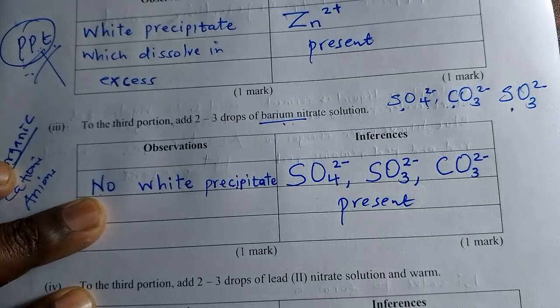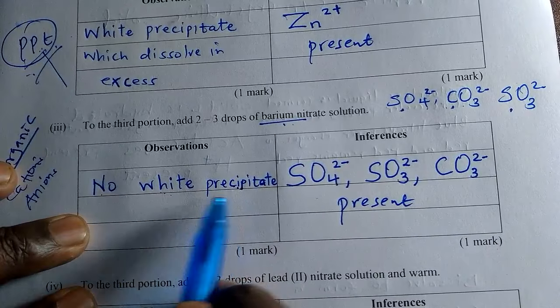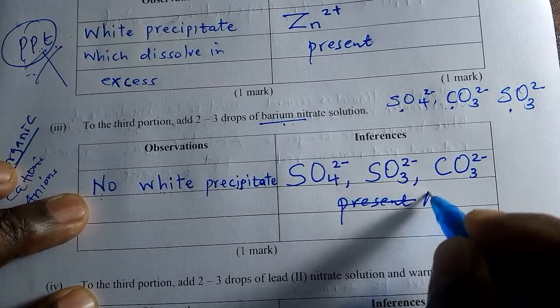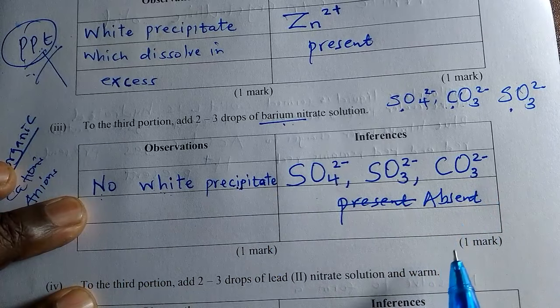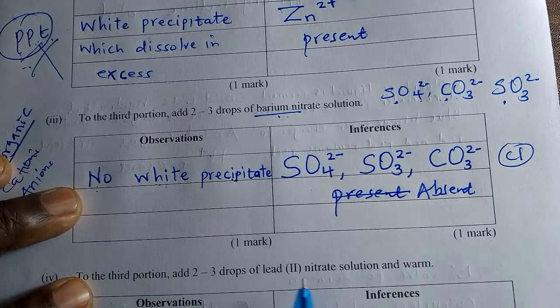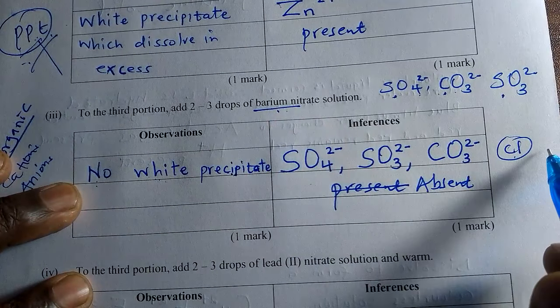You see? Present if the white precipitate is formed. Because there is no white precipitate, it is absent. No white precipitate, these ones are absent. Don't include chloride. Chloride is only for lead. Barium chloride is a colorless solution. Please remember that.